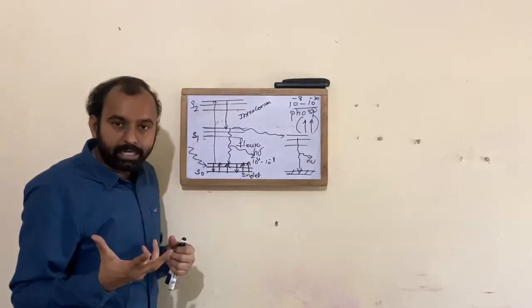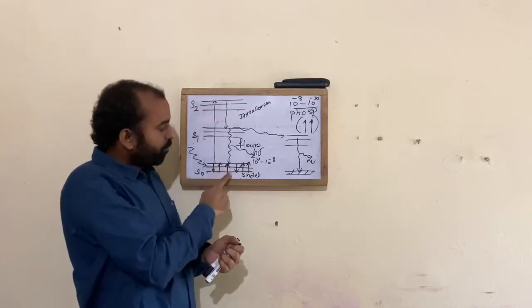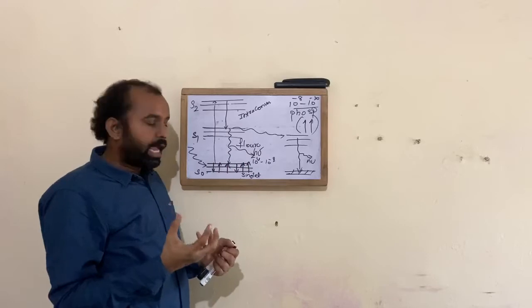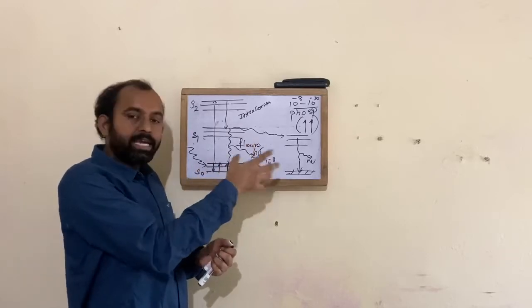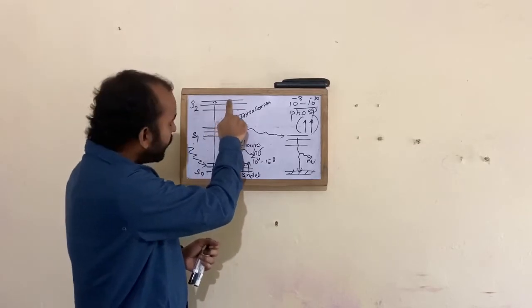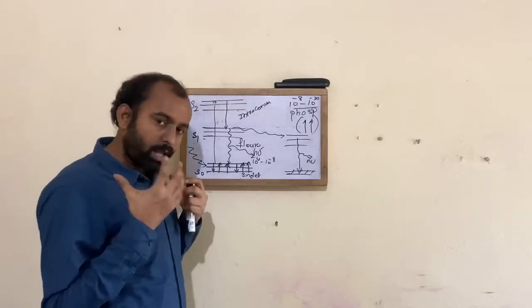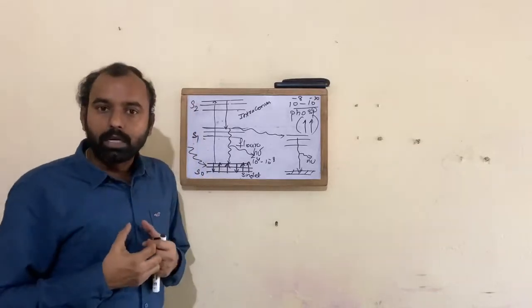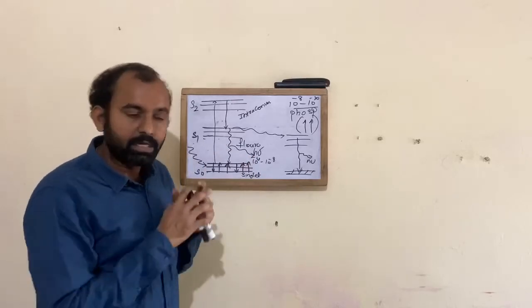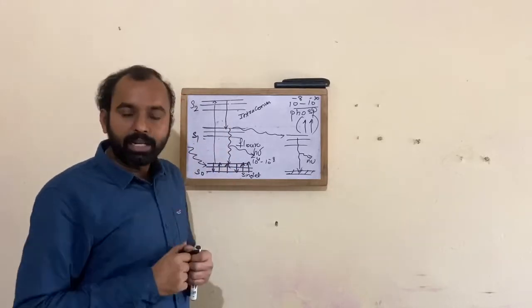So here it is spontaneous emission of radiation after absorption of electromagnetic radiation of a certain wavelength; the energy of excited molecules will return to the ground state by releasing some amount of photon. The photon released will be lower in energy in comparison to the incident ray and higher in wavelength. Now you have a question, why is my molecule having lower energy? Because in coming from the higher excited state to the ground state, it will have collisions. The collisions between the molecules will cause energy loss. That's why the emitted photon has lower energy and a larger wavelength. This is the fundamental information of fluorescence spectroscopy. This is the modified Jablonski diagram to explain the fundamentals of fluorescence.